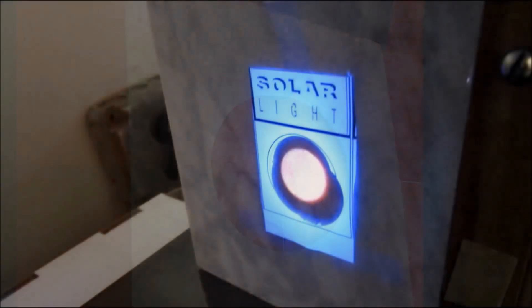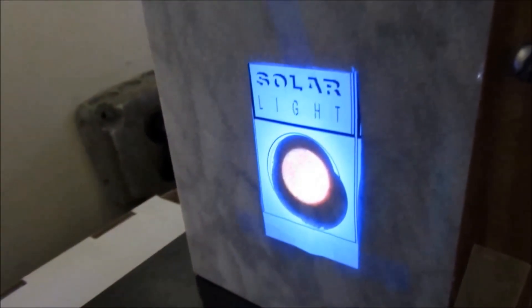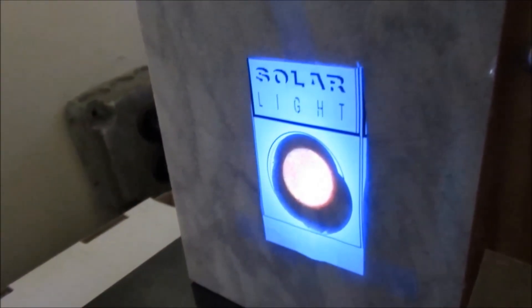Using our own NIST traceable calibrated UV sensors, we take many uniformity measurements, and a great deal of care is applied to maintain the exposure conditions for the specimens.